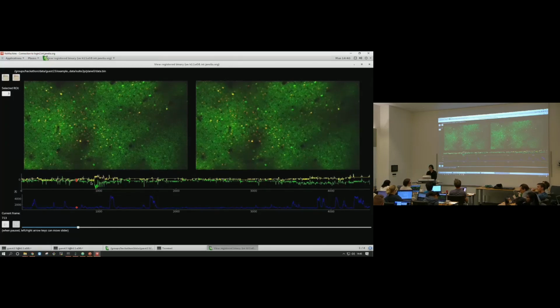And then for max non-rigid shifts, we set it to 8 pixels. And that's something, I think it's set to 8 pixels by default. I'm not sure. It's 5 by default? Okay. So that's something you might want to make bigger or smaller.